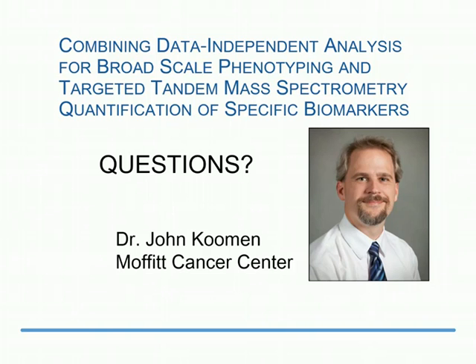Okay, first one is, what is the limit for the DIA method? So we're still, I think, trying to figure this out, but obviously the most abundant proteins and the highest signal peptides from each protein are the best represented, and we're trying to figure out where that line can actually be drawn by matching some of our samples with DIA analysis with an MRM-based approach to quantify the levels of the proteins that we observe.